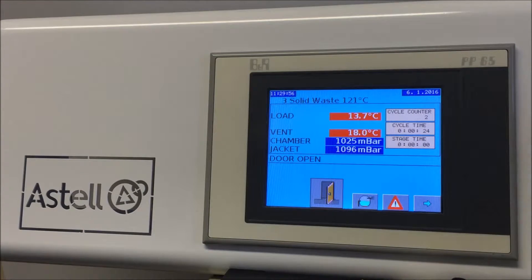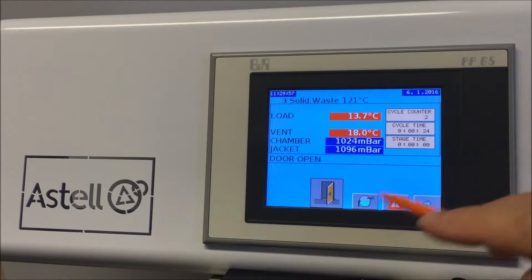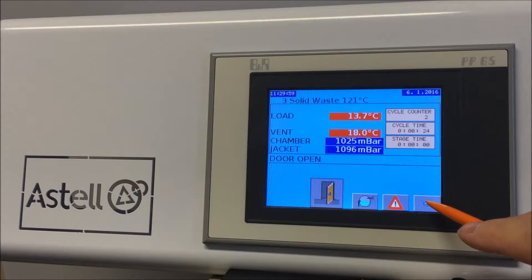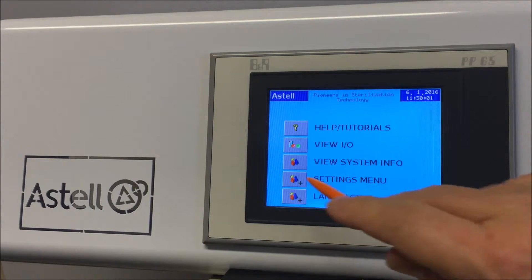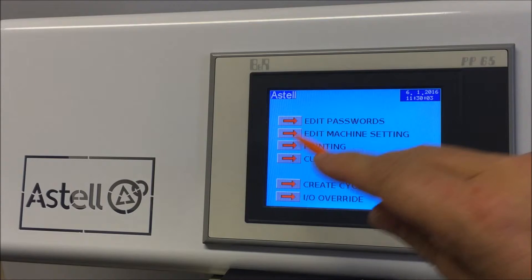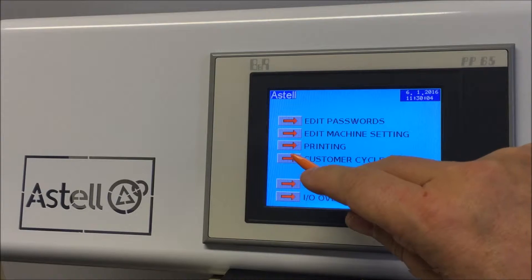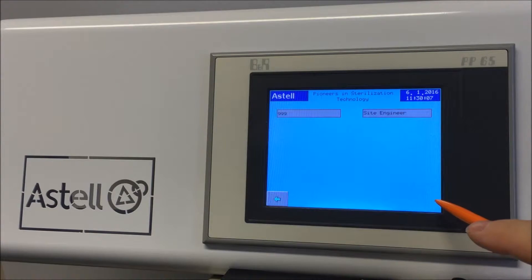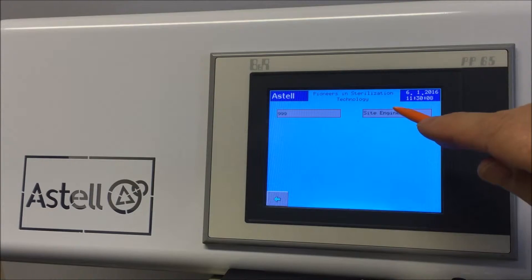How to change the sterilization time. Press the right arrow icon on the bottom right of the screen and select the settings menu. Select customer cycle edit, then press the right-hand arrow icon on the bottom right of the screen and select Site Engineer.